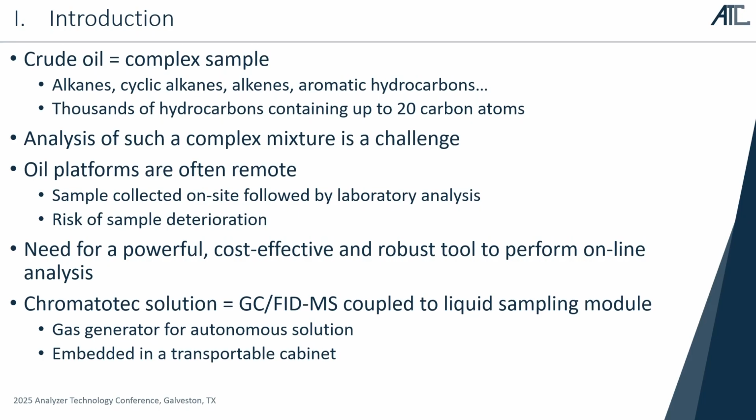Oil platforms are often remote, not close to any lab for measuring. So there is a need to measure this in the field, because sample collection in the field followed by laboratory analysis is time consuming, and there is a risk of sample deterioration for some reactive molecules which can react together during the time of transportation or with temperature effect, etc.